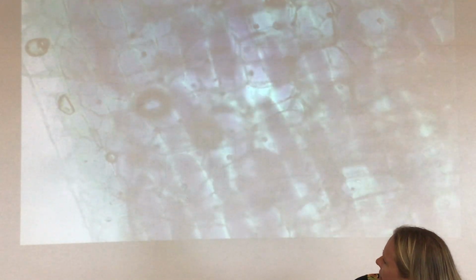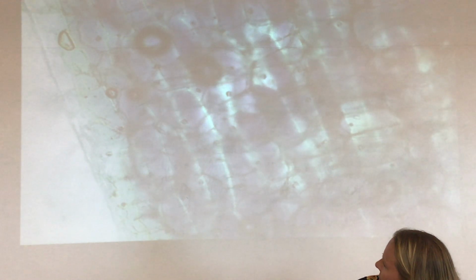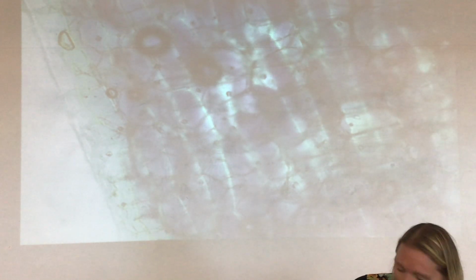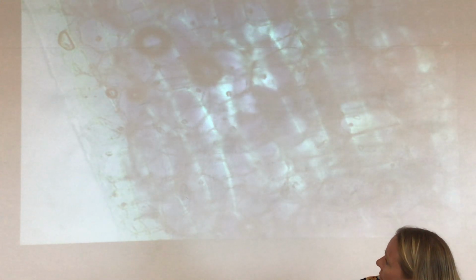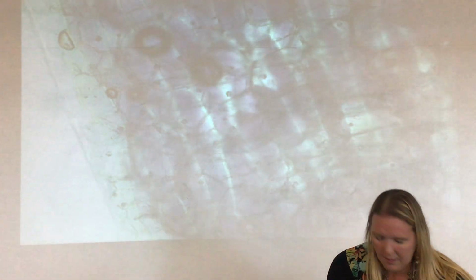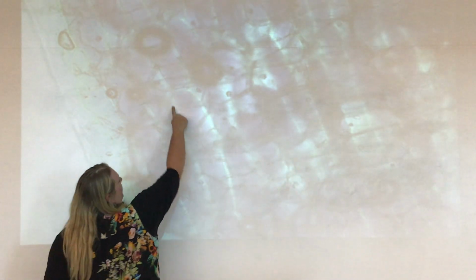I'll try the other one. Maybe that one. All right, I'm going to use this one right here. It's not 100% clear, but I'm going to use this cell right here.